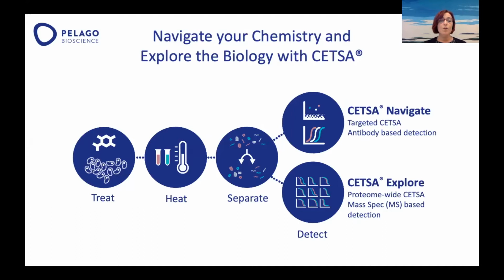The core protocol is to treat and then apply a heat shock, and then separate and detect. We measure the soluble proteins that are left in solution after the separation, after the heat shock. We have two different formats: the CETSA Navigate, which is a targeted CETSA for antibody-based detection, and the CETSA Explore, which is the proteome-wide CETSA for mass spec-based detection. This is also known as TPP, thermal protein profiling, or PISA, protein integral solubility alteration. But here at Pelago, we call it CETSA Explore for the proteome-wide CETSA.